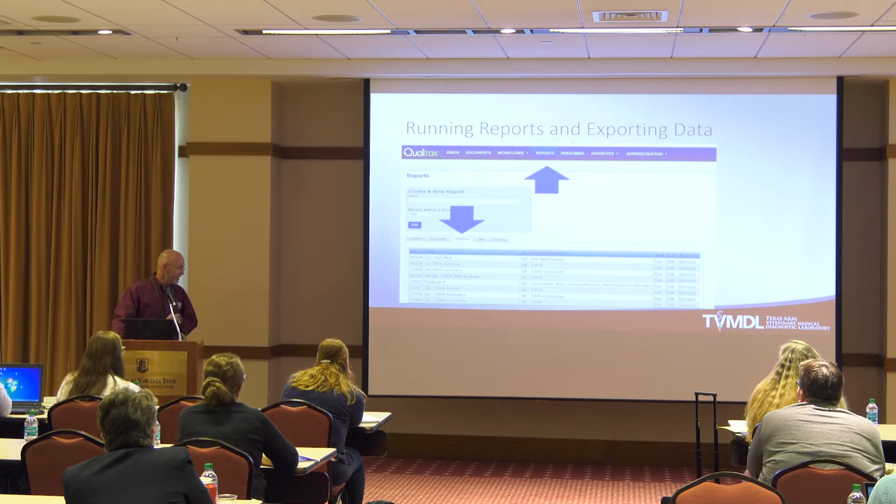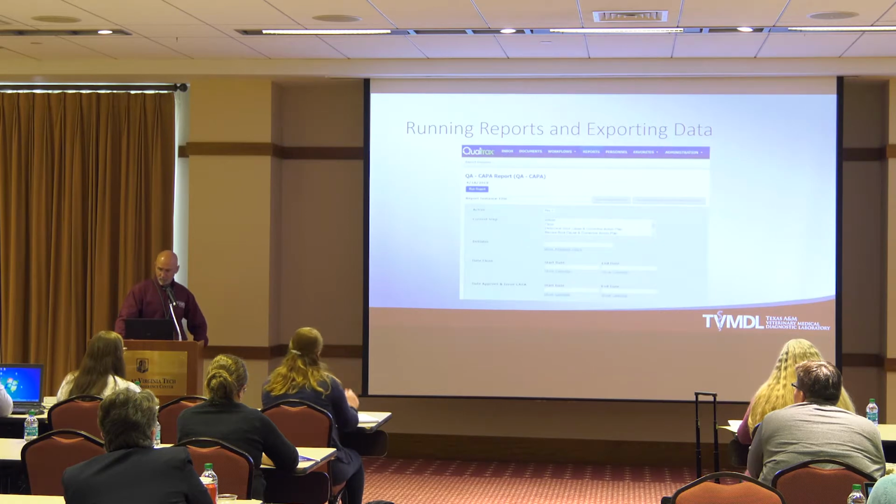We create the reports, typically it's just for us. So QA has many, many reports. For the sections, they have just a few. So select the reports, then select the workflow tab, and then select the specific report that you want to run. You click run. From there, for us, we select the date.